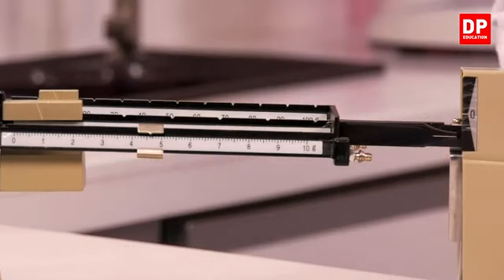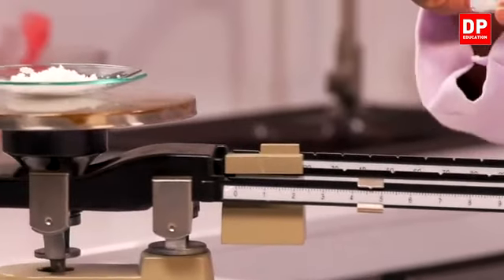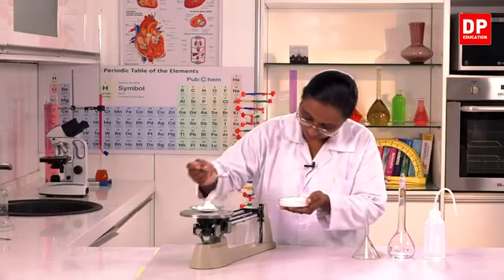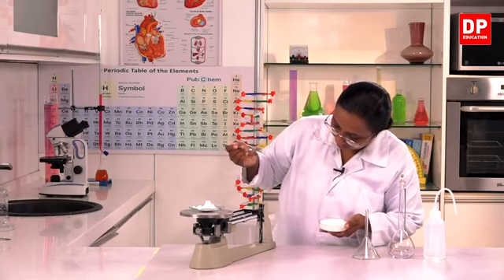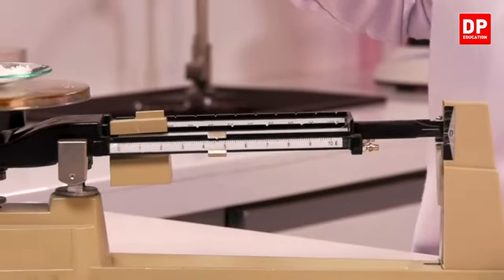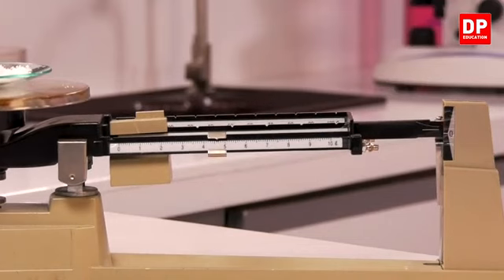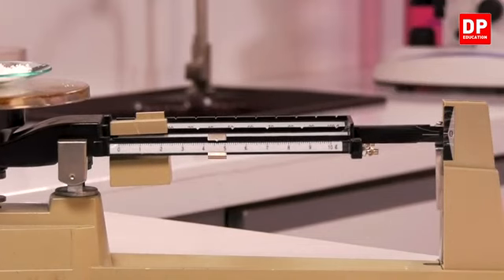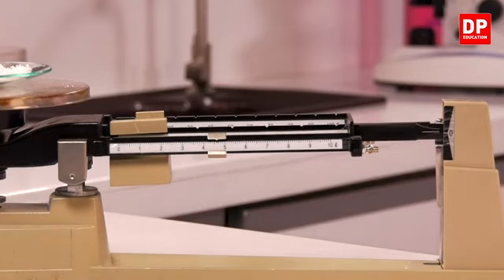So to that, if I add the sodium chloride, then we will be able to weigh 14.6 grams. We have to weigh the exact amount of sodium chloride. Now you can see the scale coming to a balance. If it points to 0, that means we have weighed 14.6 grams.